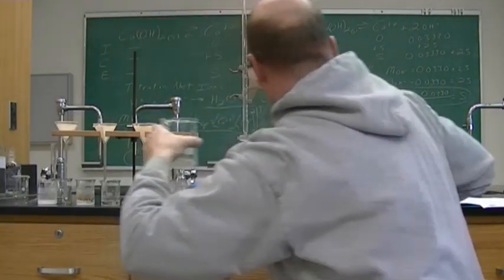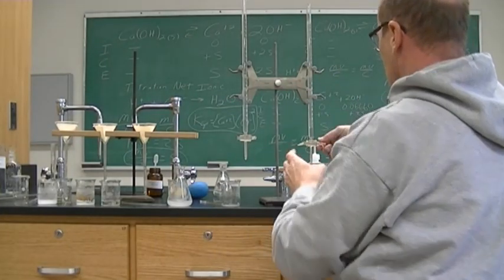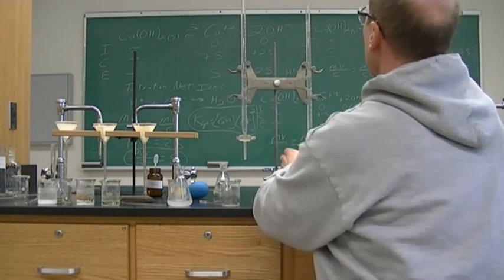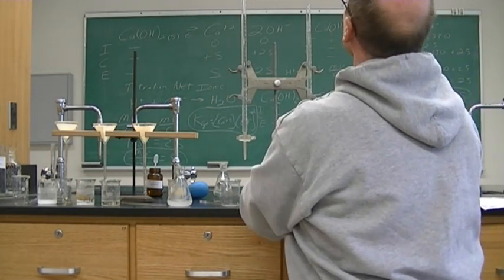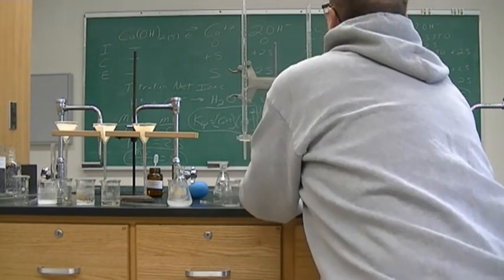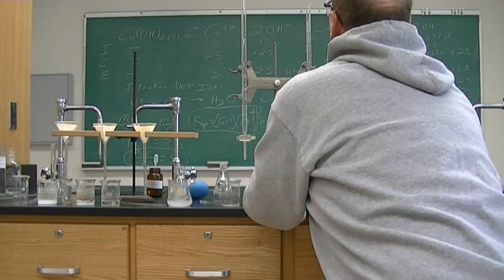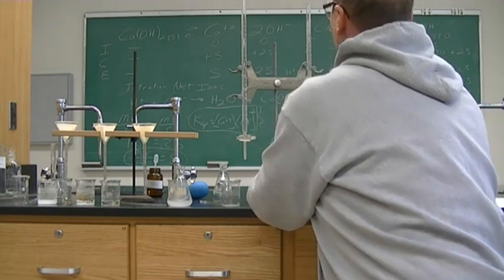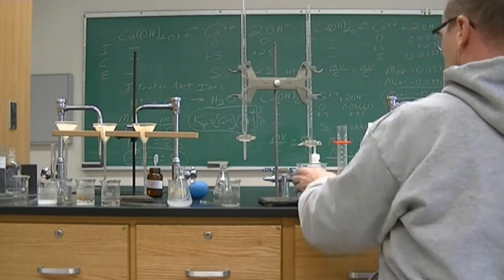All right, and then we open it up to get rid of the air bubbles. All right, this time I'm going to do it a little different. I'm going to start at 3.00.